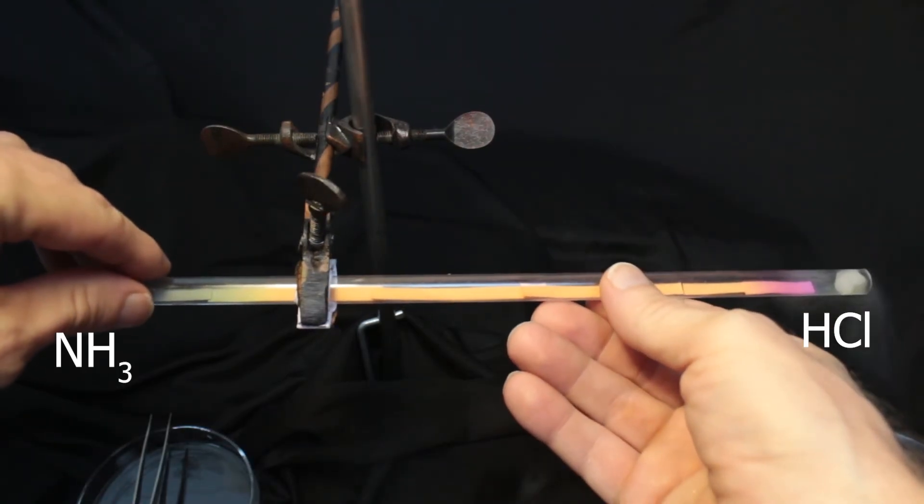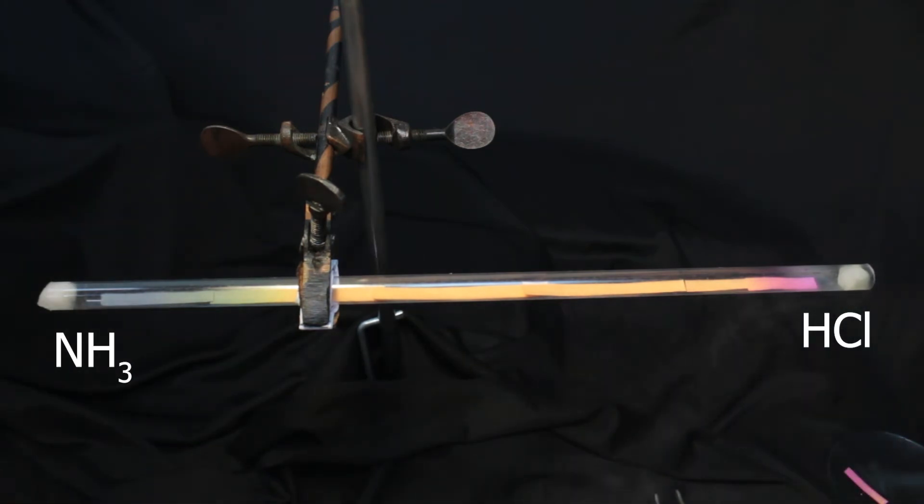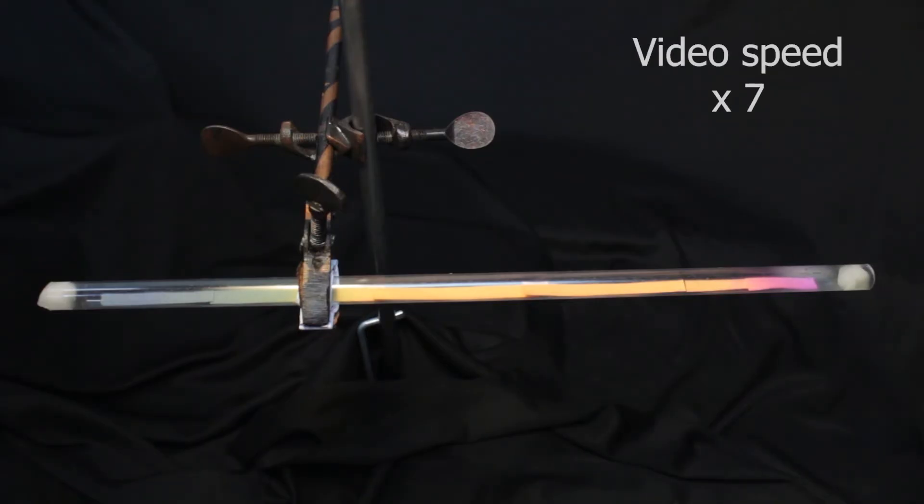The diffusion already started. The molecules of gases move towards each other in the tube. Blue-green is the track of ammonia, and red is the track of hydrogen chloride. Here I sped it up, otherwise we would have to wait for a few minutes.